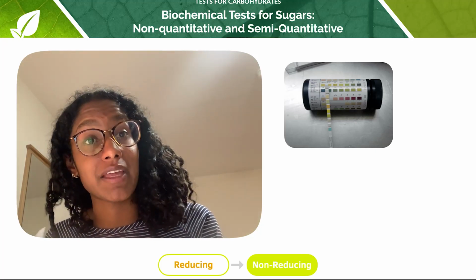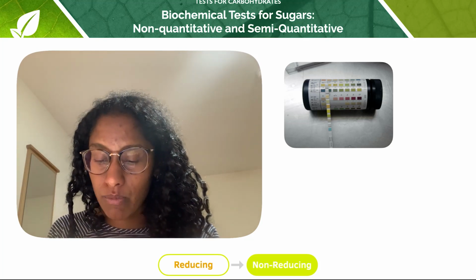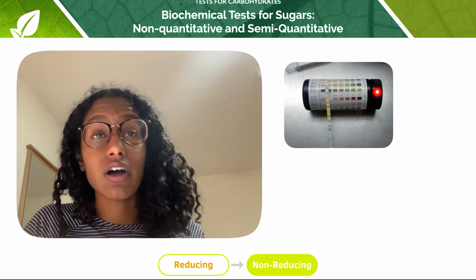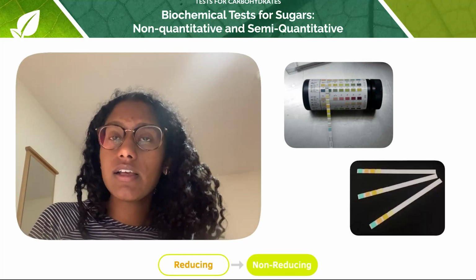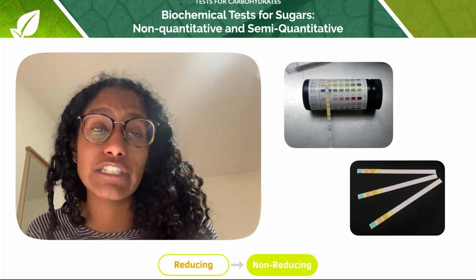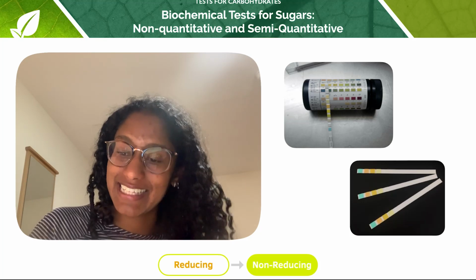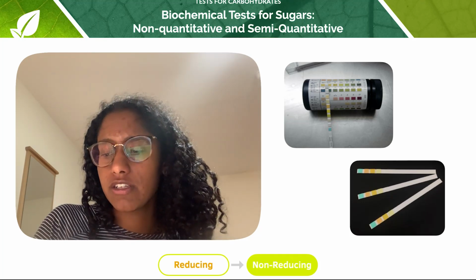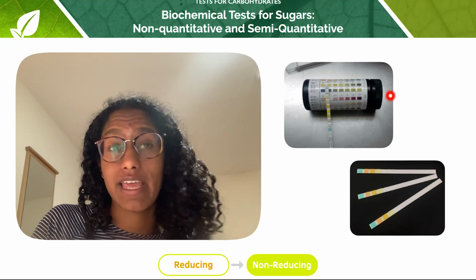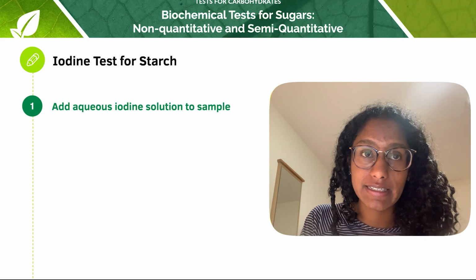And this occurs in something like diabetes, for example, where you get glucose in the urine. In the same way, you just compare the colour on the strip with the chart on the bottle. So the degree of colour change that occurs in the reagent can indicate the concentration of that glucose in the urine. And we can compare, as I said, this final colour on the test strip to the correlating concentrations on the bottle here.